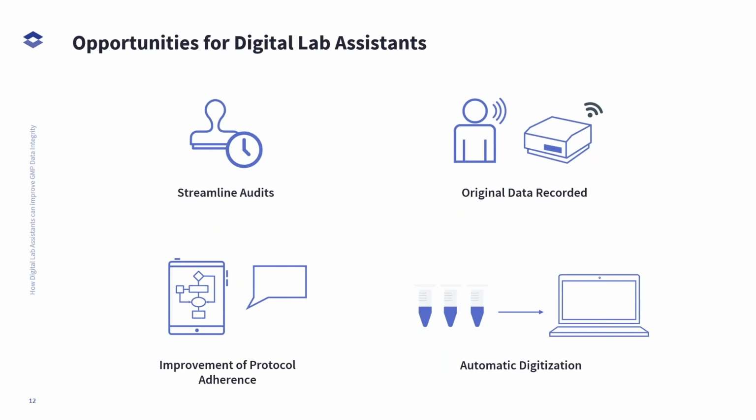Yeah, well, I'm going to take the topic of SOP compliance and improvement of protocol adherence, because, let's say, nobody really votes for that, but I think it's also because it's hidden in a second layer. So how are you going to measure compliance if you have everything on paper and it's not really traceable what you have?